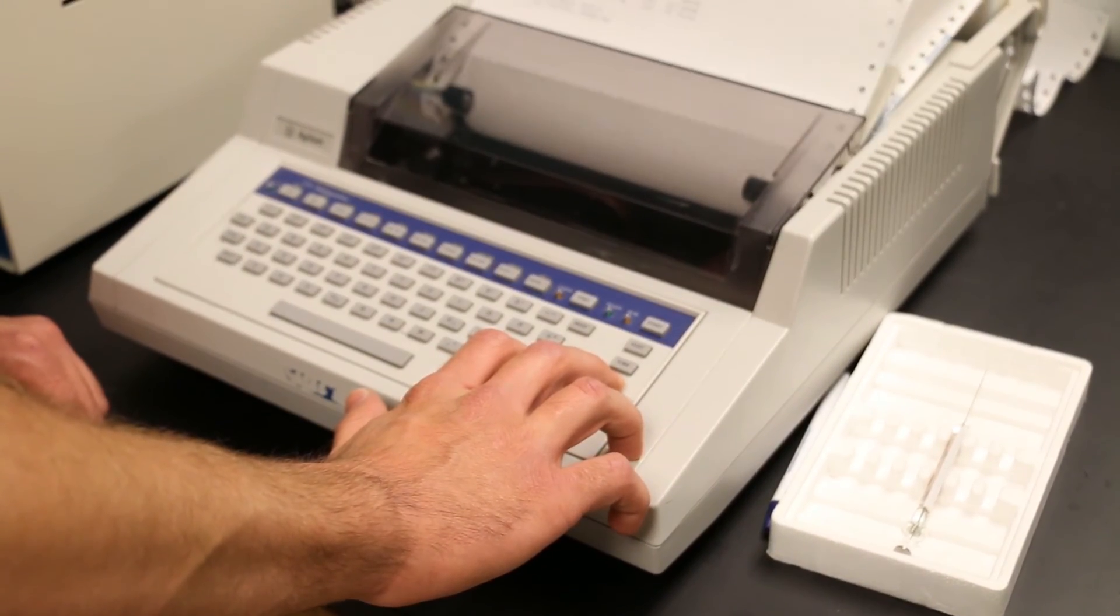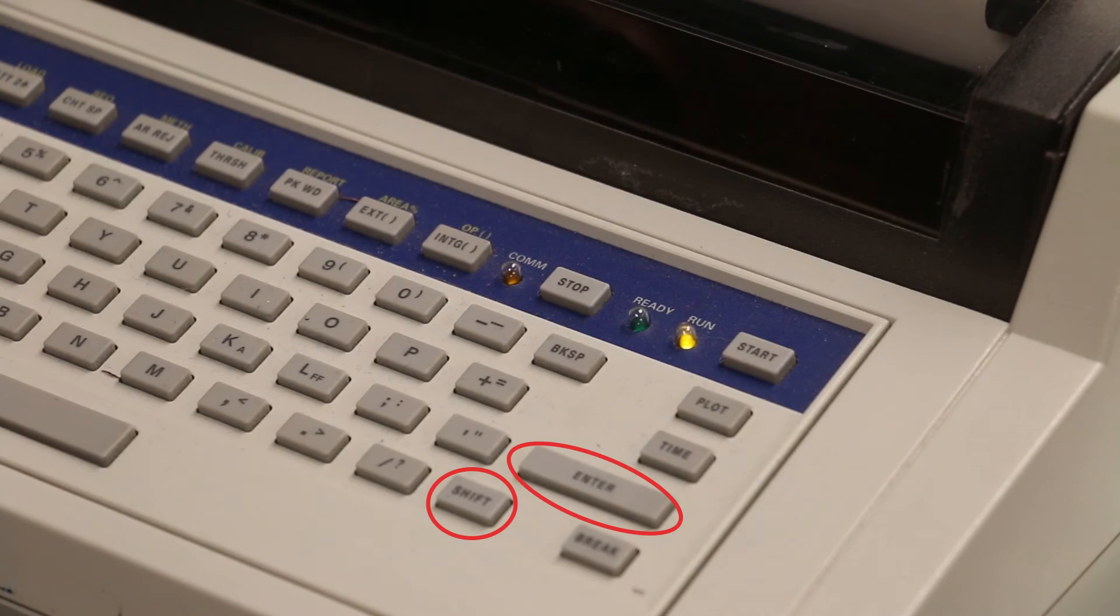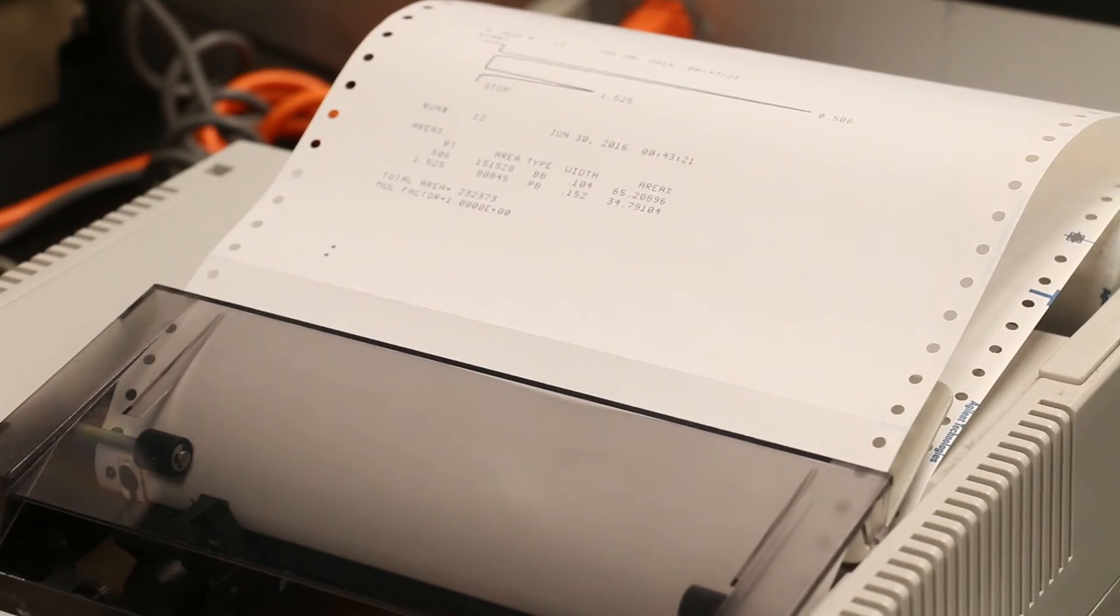You'll need to feed the paper up on the integrator by pressing shift and enter buttons simultaneously until your printout can be easily removed.